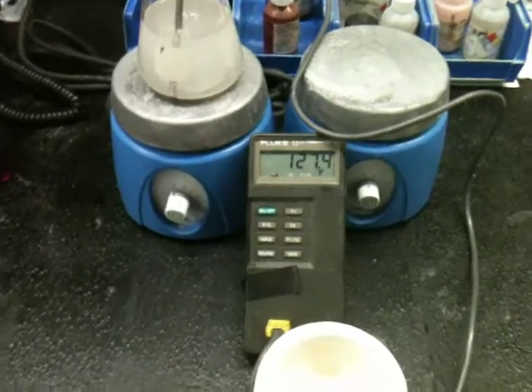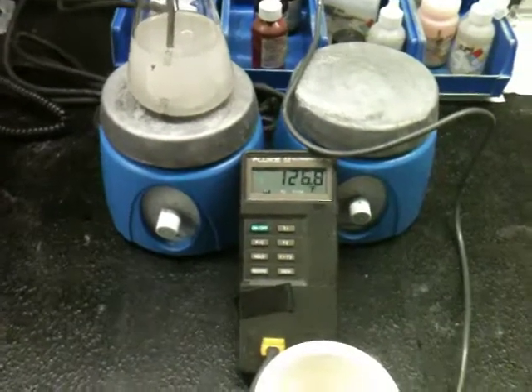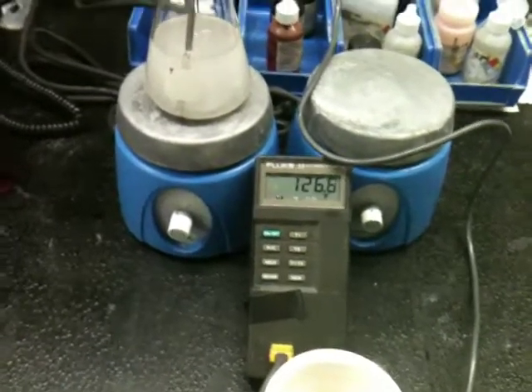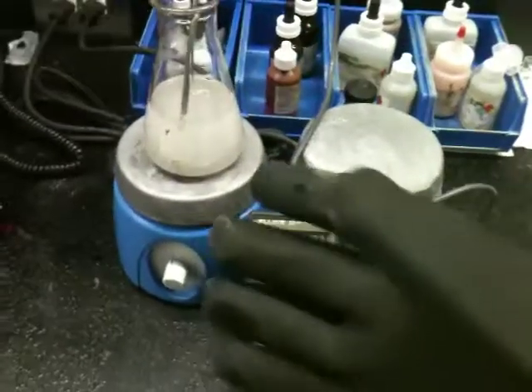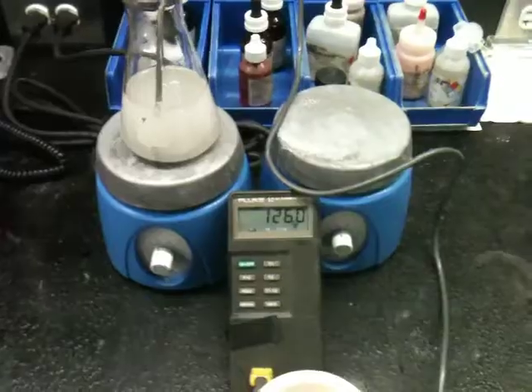Most people think that it's the acidity that's painful to you, but this is a very strong base that will hurt you just as well. That's why I wear the protective neoprene gloves while handling the material. Thank you.